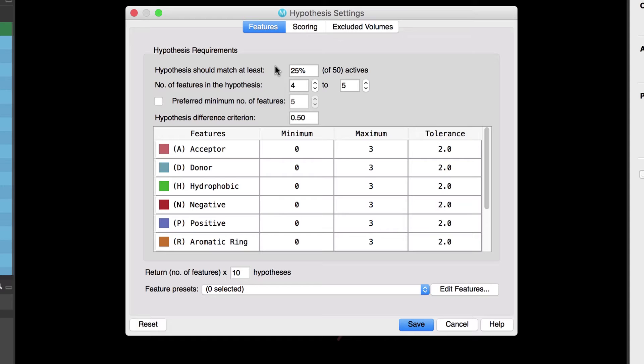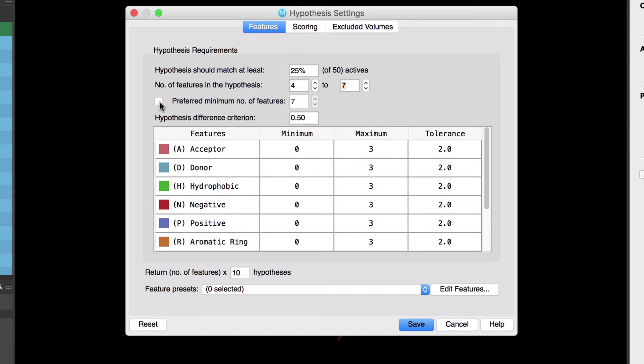And we'll want to allow flexibility in the number of features in any given hypothesis so let's set a wider range for the number of features in the hypothesis to range from four to seven. But then we'll set the preferred minimum number of features to five.